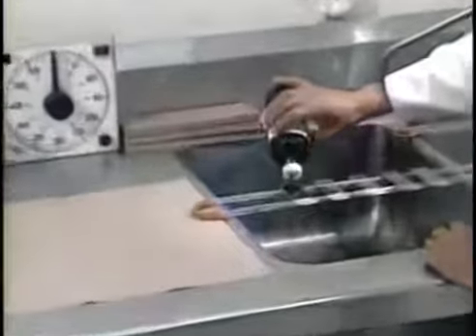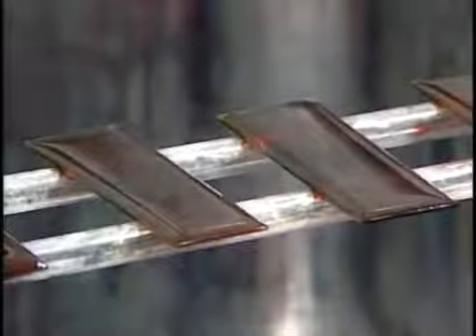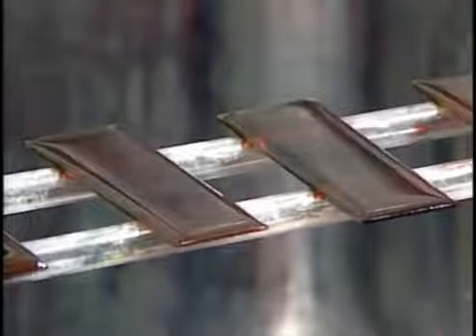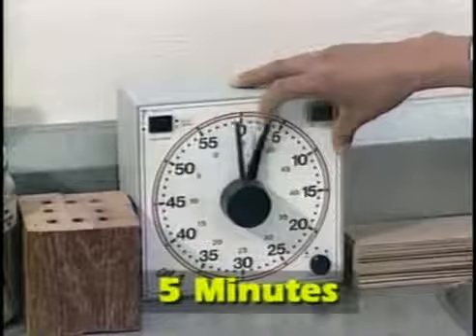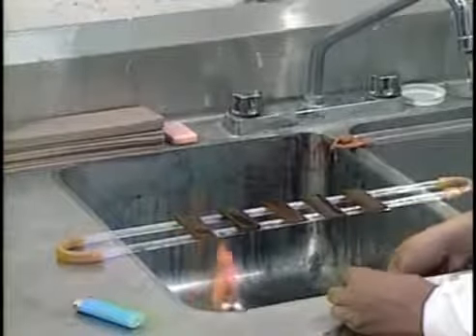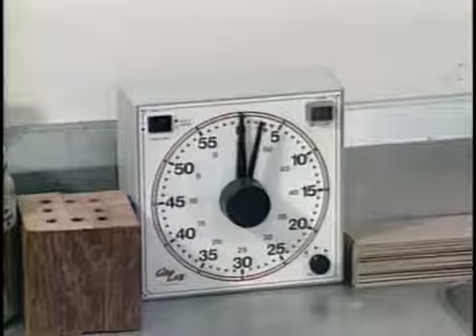Cover the entire surface of each slide with carbol-fuchsin. Using a Bunsen burner or cotton and alcohol flame, gently heat the slides until vapor rises. Do not allow them to boil or dry. Boiling will alter the shape of the TB bacilli and could result in a false negative reading. Allow the stain to remain on the slides for 5 minutes. Maintain heat throughout this period. Adequate time is required for the carbol-fuchsin to penetrate and stain the cell wall.